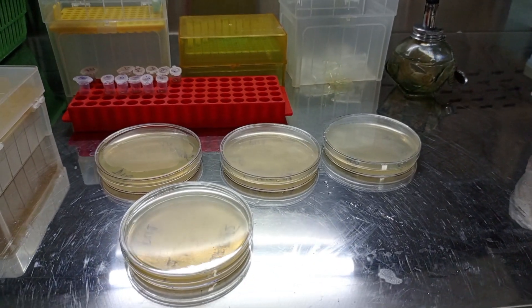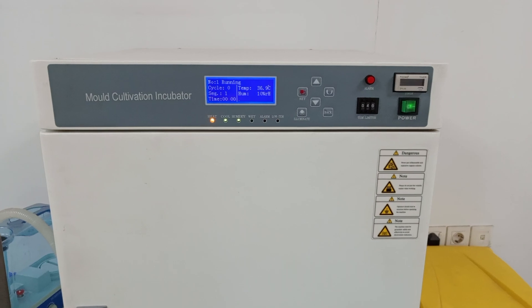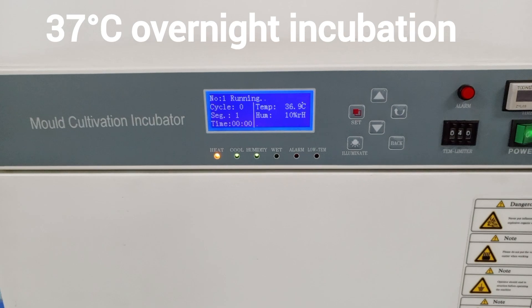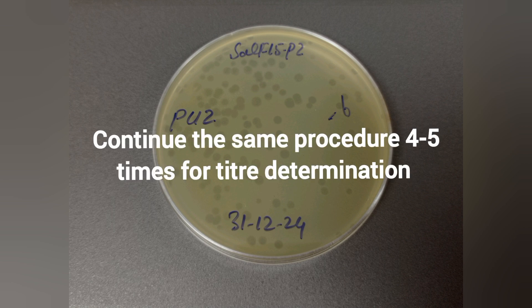Allow the plates to cool at room temperature until the top agar is solidified. These plates are then kept in the incubator at 37°C for overnight incubation. The next day, you will get clear zones of plaques appearing in the bacterial lawn. Continue this purification process 4 to 5 times, and then the final purified suspension will be used for titer determination.